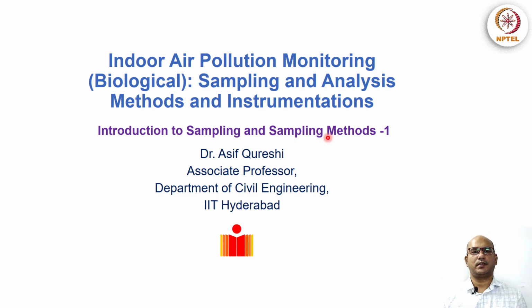Hello all. In this lecture, in this week, we will cover indoor air pollution monitoring for biological samples, for example, bioaerosols. We will cover the sampling methods, analysis methods, and cover some instrumentations.